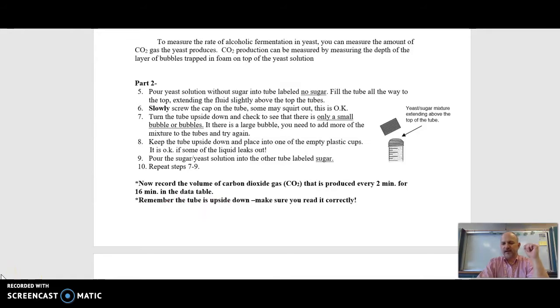All right, I'm back again. Now, it's been a few minutes. It's been about 5 minutes. So now I'm going to follow the directions for part 2, and then I'm going to start to take readings. So I'm going to show you how to do the setup for part 2 with my camera.